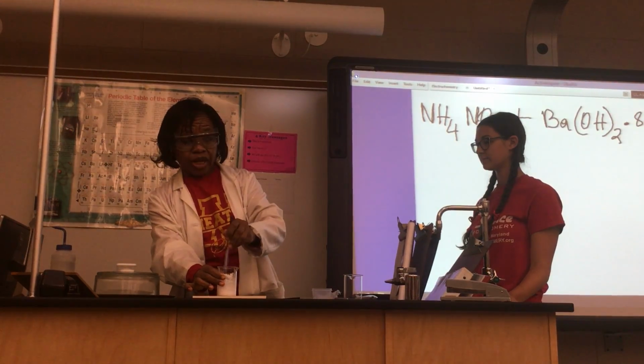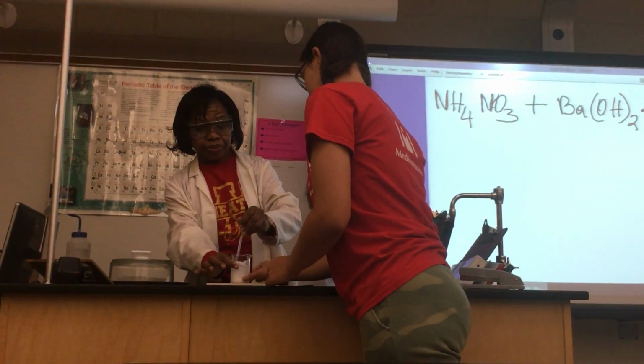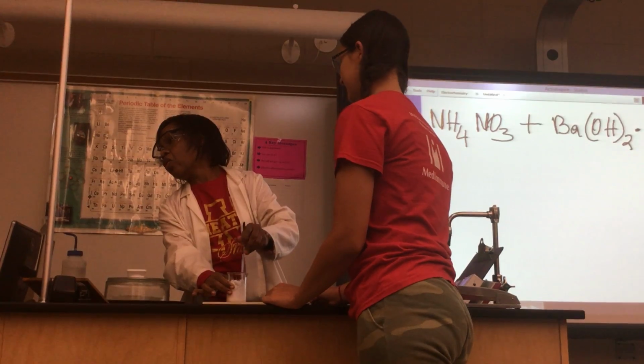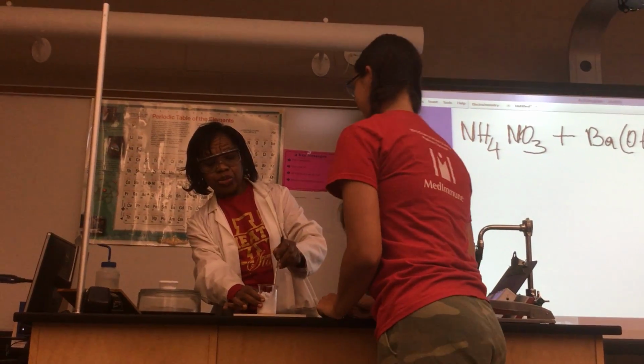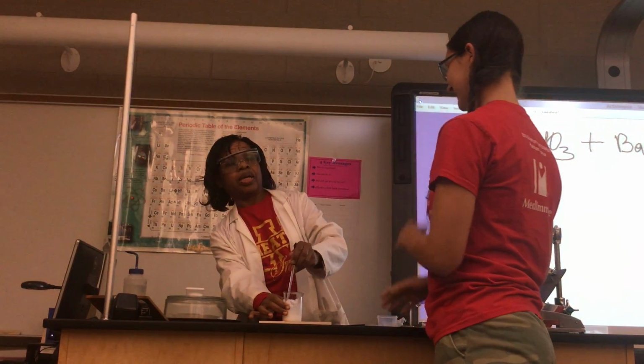Don't put your nose too close. You can come right here, right now. Touch the beaker. How does it feel? It's cold. Very cold. Okay, how about if you try not to get too close? Okay, waft it to your nose. Bring it with your hand to your nose and tell me what do you smell?